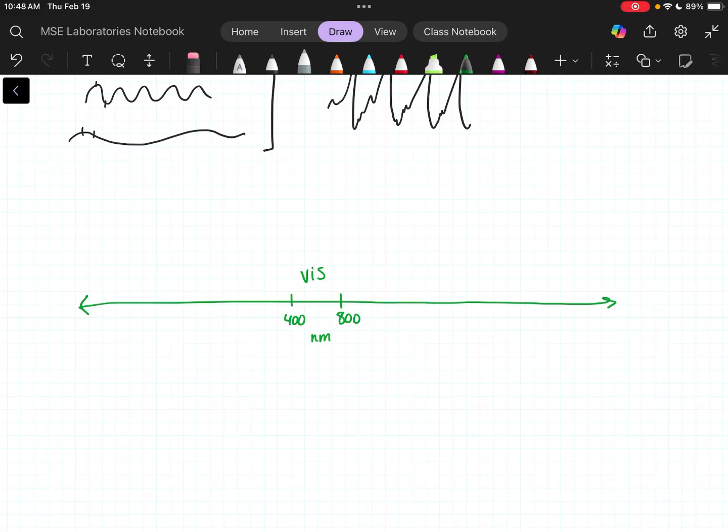And we're talking wavelength here, not frequency or energy. A lot of times they will use frequency or energy on these kinds of scales. I'm going to talk about wavelength because that is how FTIR runs. And in this case, I have higher wavelength on the right-hand side, which means I have larger frequency on the left-hand side. And larger frequency is the same as a larger energy or higher energy.